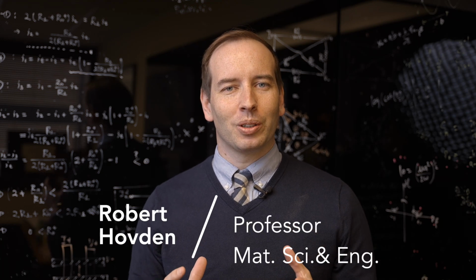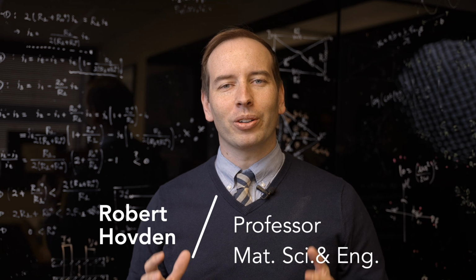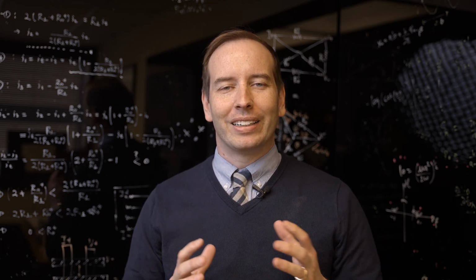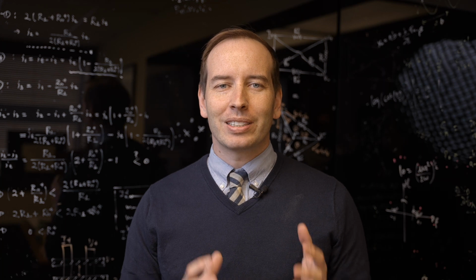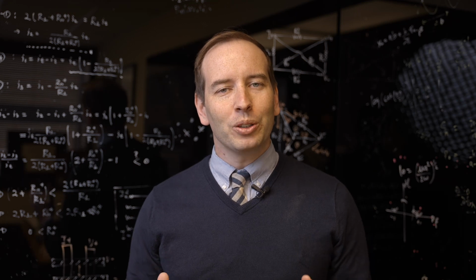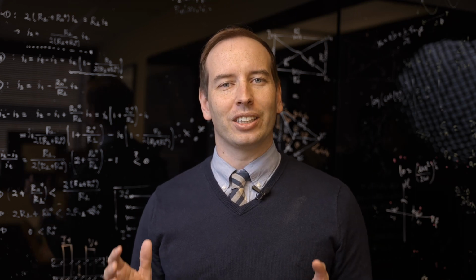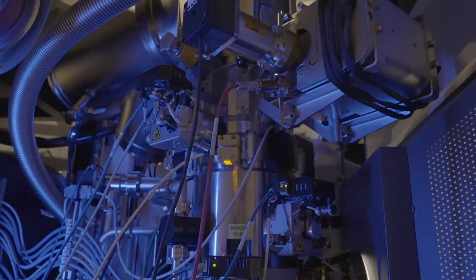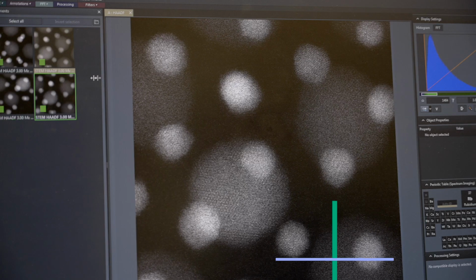Our lab focuses on seeing the invisible worlds. We like to explore things smaller than light itself. A lot of new technologies are being made at the nano and even atomic scale. Seeing things this small is very challenging because it's smaller than light itself. So what we do in our lab is use high energy electrons, where matter has wavelengths down to a few picometers. And this gives us the resolving power we need to see atomic structure and nanoscale technologies.